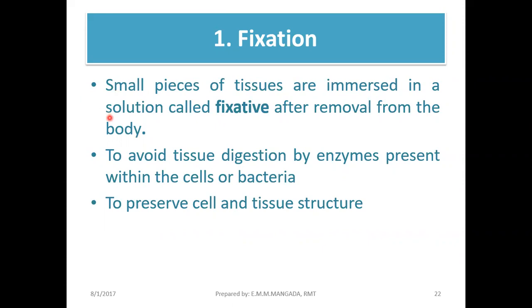So, our specimen will be soaked or immersed in a solution and this solution is what we call your fixative. Okay? So, sa laboratory, ang pinaka-common na ginagamit natin ay yung mga chemical fixatives natin. Okay? And the best general fixative is actually your 10% neutral buffered formalin. Okay? Guys, tatandaan nyo, best general fixative is your 10% neutral buffered formalin.